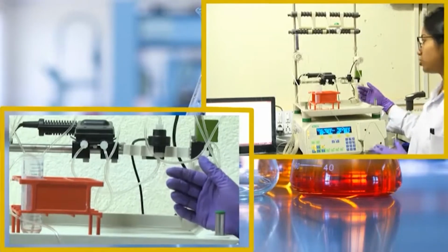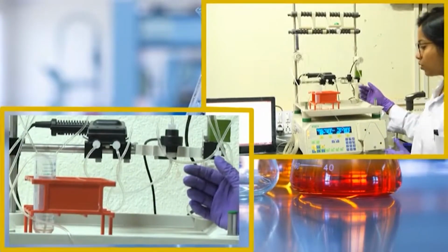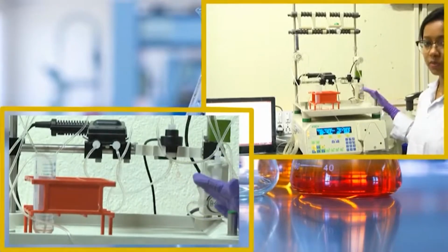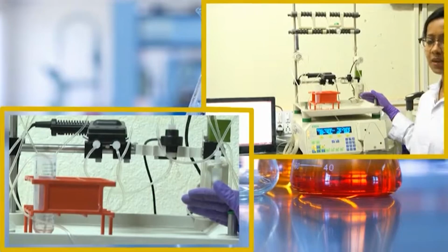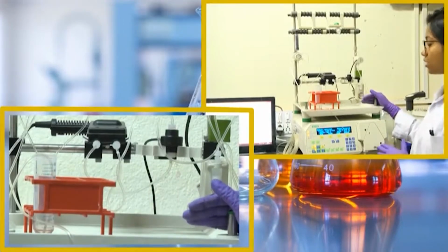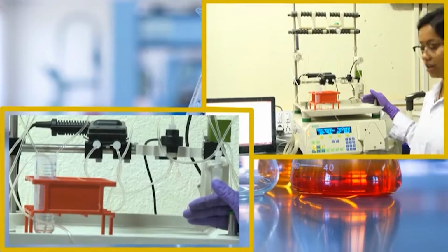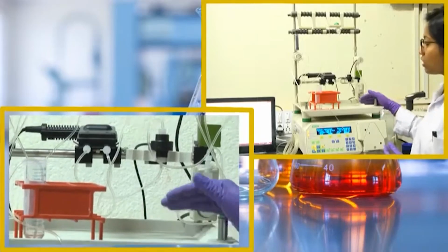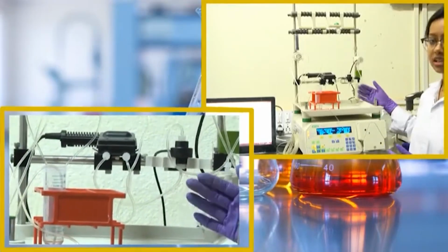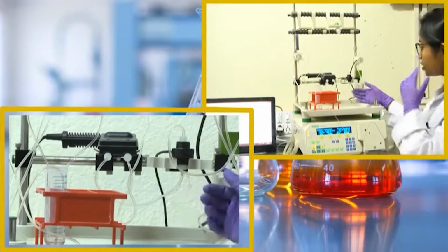There are cleaning procedures which you need to follow. Those will be provided by the instrument manufacturer where you purchased the instrument, so always follow that. Mainly what we do in our case is pass NaOH and HCl in a proper amount. So, 1 molar NaOH and then water, and then 1 molar HCl and then water. That will clear out any salt precipitation or anything which has been precipitated in the column as well as in the tubings.